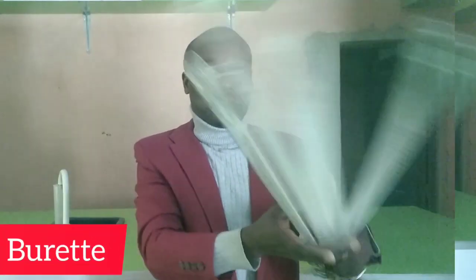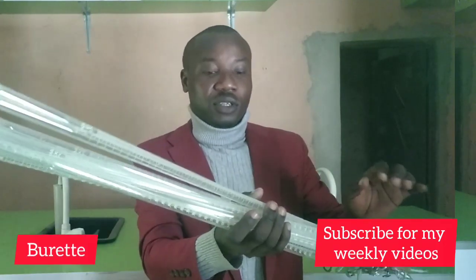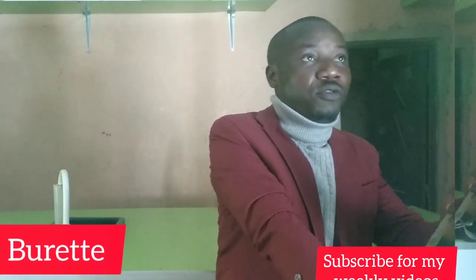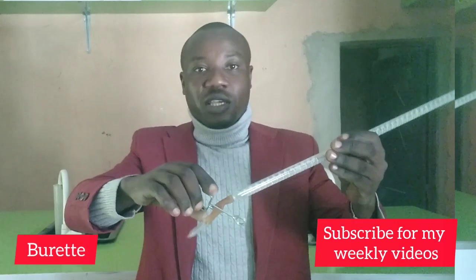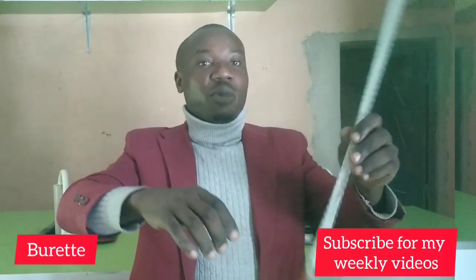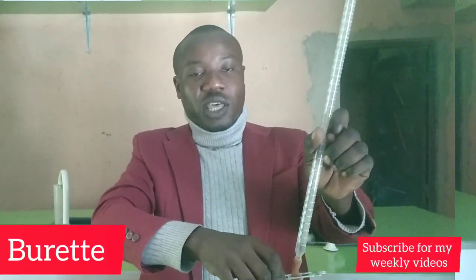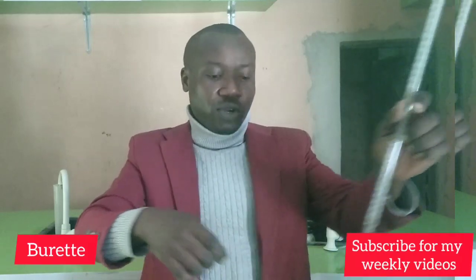Holding right away is the burette. This is what we call a burette. We use it in titration, and it has measurement from 0 to 50. It has a section we call the clip, and this area is called the tap. By the time you put the acid inside for the titration, you have to open the tap, and the liquid, that is the acid inside, will flow down.